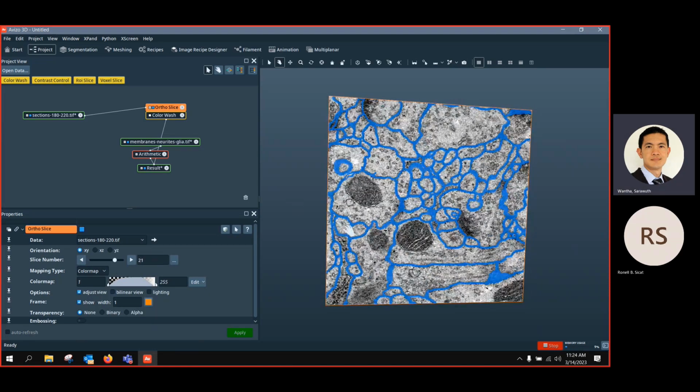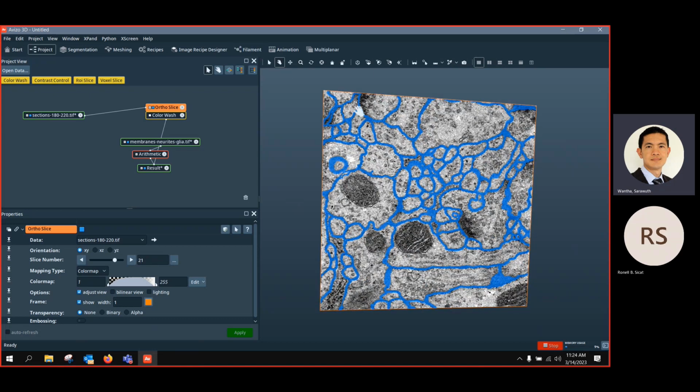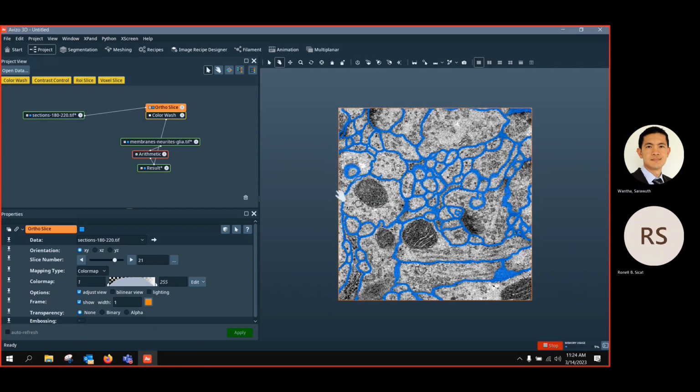For this tutorial, we don't have another new data set. So we're going to use a small subset of the image for training. Usually you test the training on new images, but because we don't have any, we can do training on a sub volume over here, and when we get the model from the training architecture file, we can apply it to the full image later.